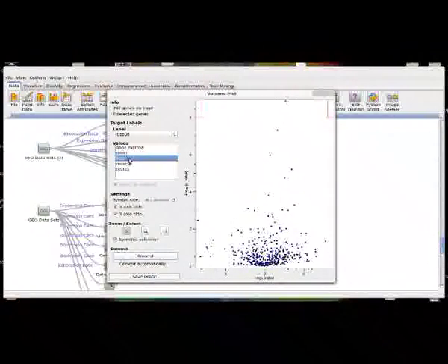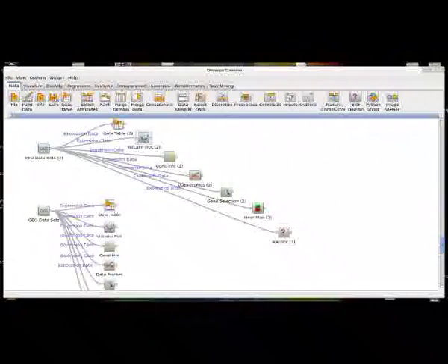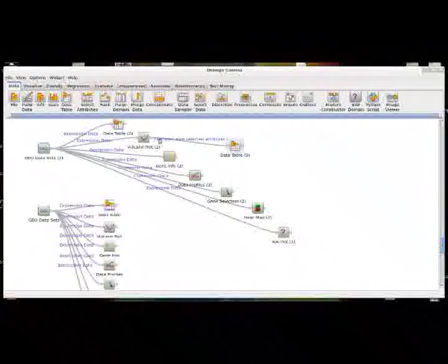For example, let's say we wanted all of our liver examples, so we can just click on liver and hit commit, and then if we bring down another data table, we take the output of the volcano plot and send it to a data table, and it doesn't work. So bad example. Let's just forget I said anything about that. I apparently need to play with volcano plot a little more.